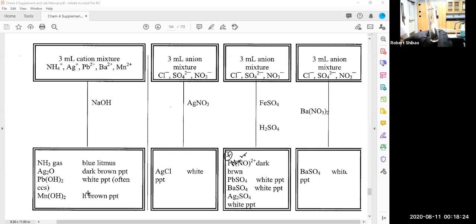You know, this is a Lewis acid-base reaction. NO is like oxygen. When oxygen reacts with your hemoglobin or sticks to it, it's a Lewis acid-base reaction. The Lewis acid is iron 2, the same here. And the Lewis base would be, in this case, NO, or the Lewis base in your body would be O2. O2 you wouldn't think of as a base, really. This test tube is extremely hot, because of the concentrated sulfuric acid.